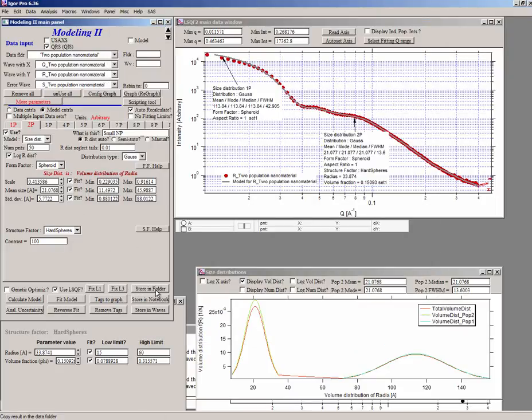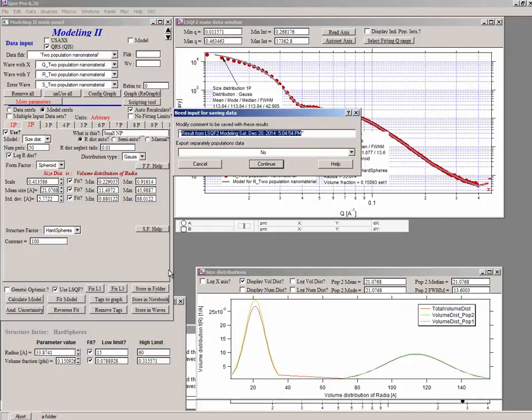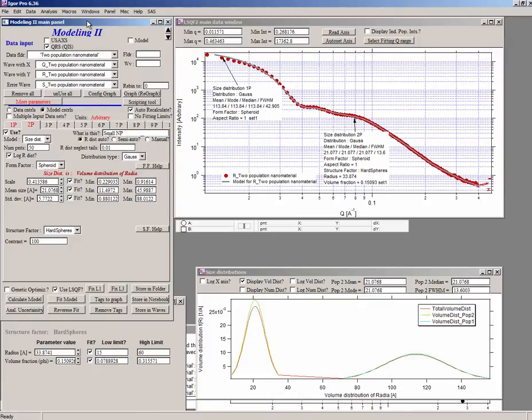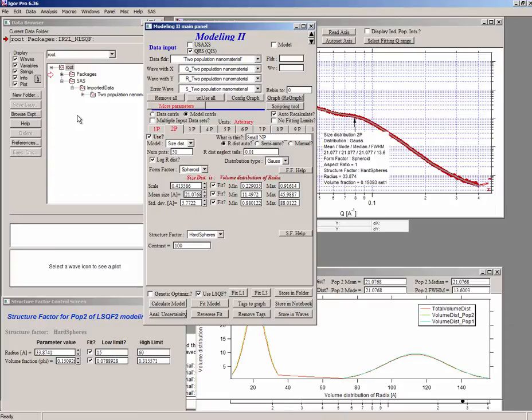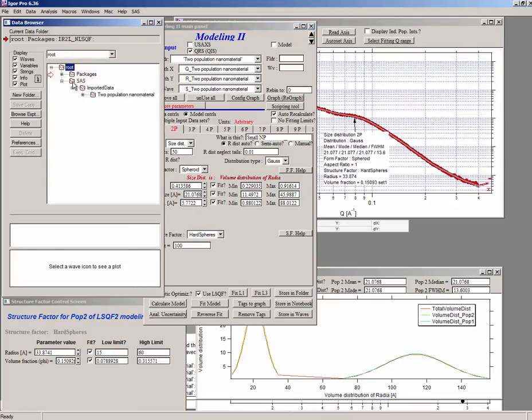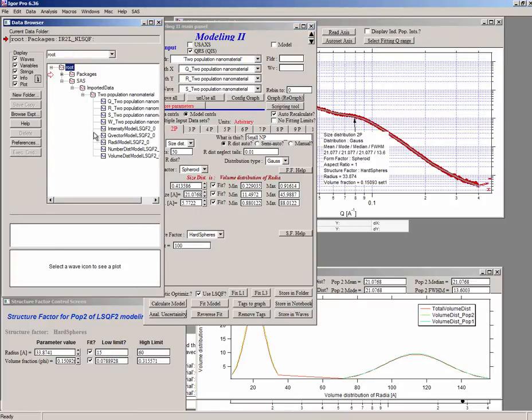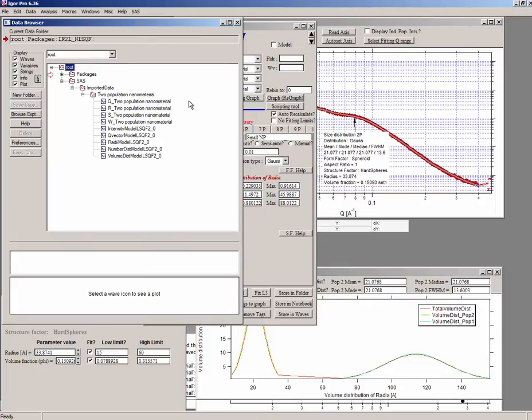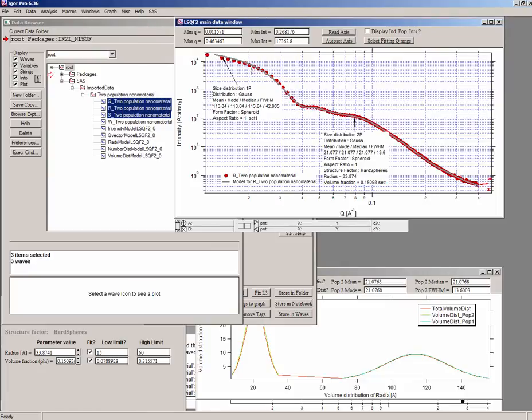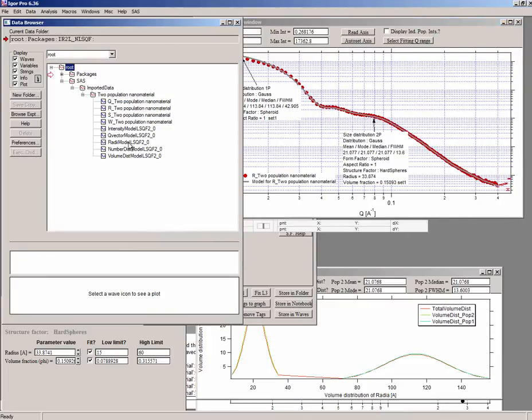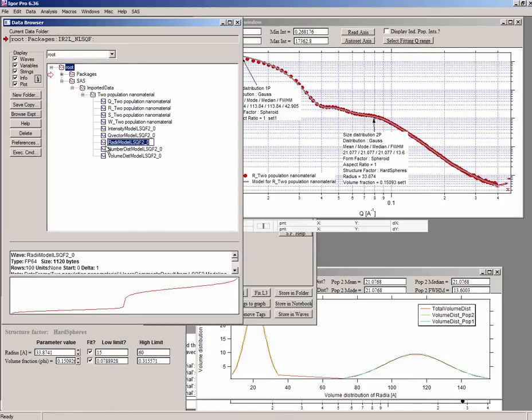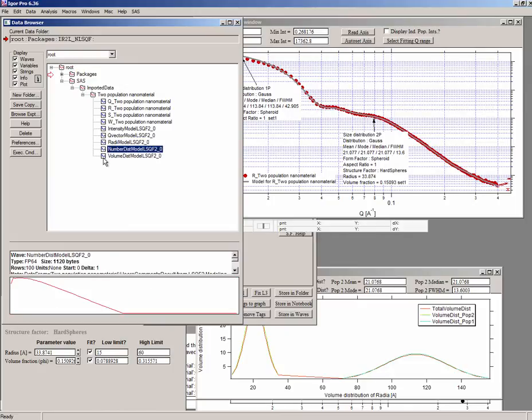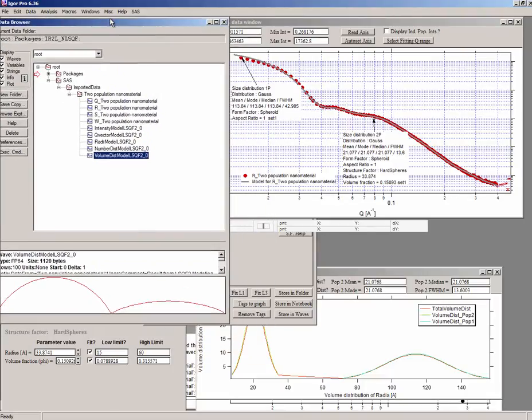The other thing which you can do is you can store it in data folder and give it a text and a name. Say continue. And now if you go back in the Igor experiment, here is what you have. So these three are the data which we loaded in. That's the data displayed here. Q is the x-axis, R is the red points intensities, and S are the uncertainties around that. We have fitted that with an intensity and Q vector as a model. And then we had, these are the radii, and then we have a number distribution and volume distribution associated with those.